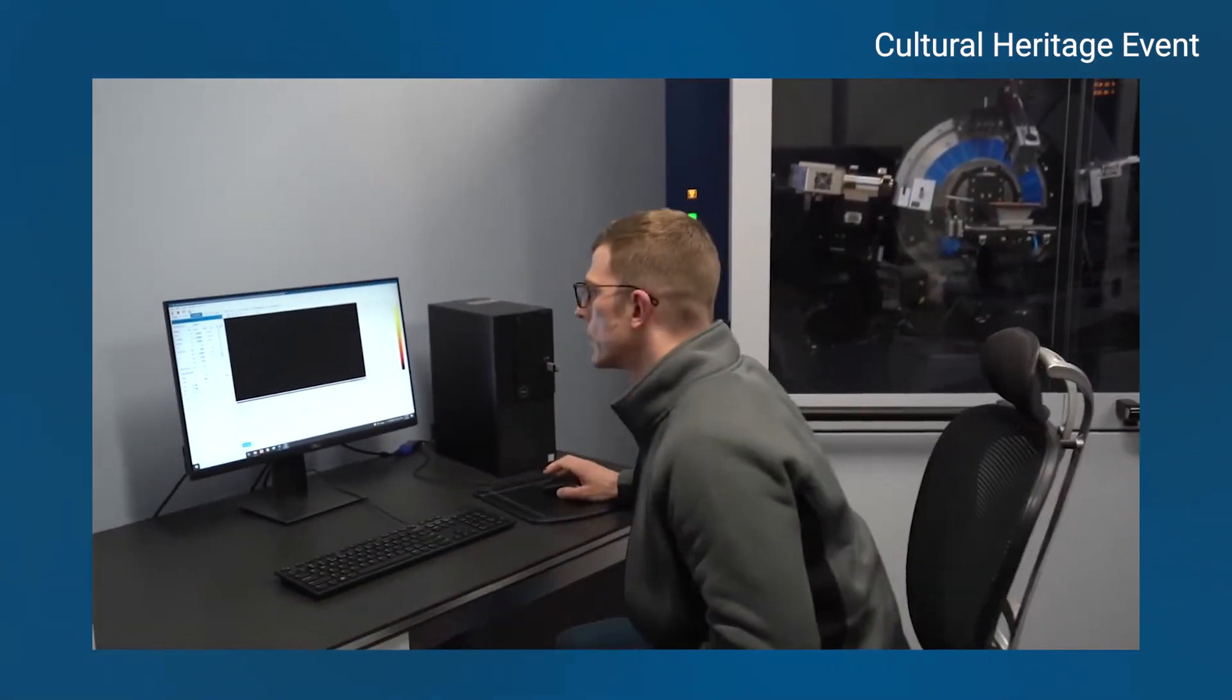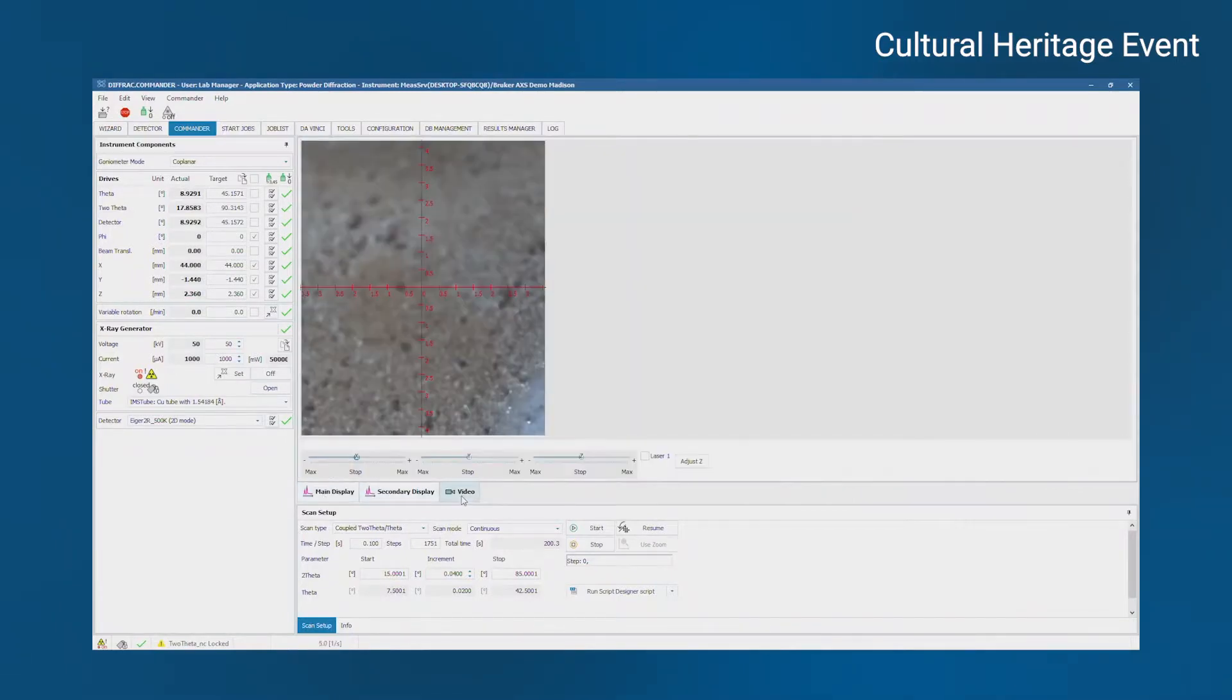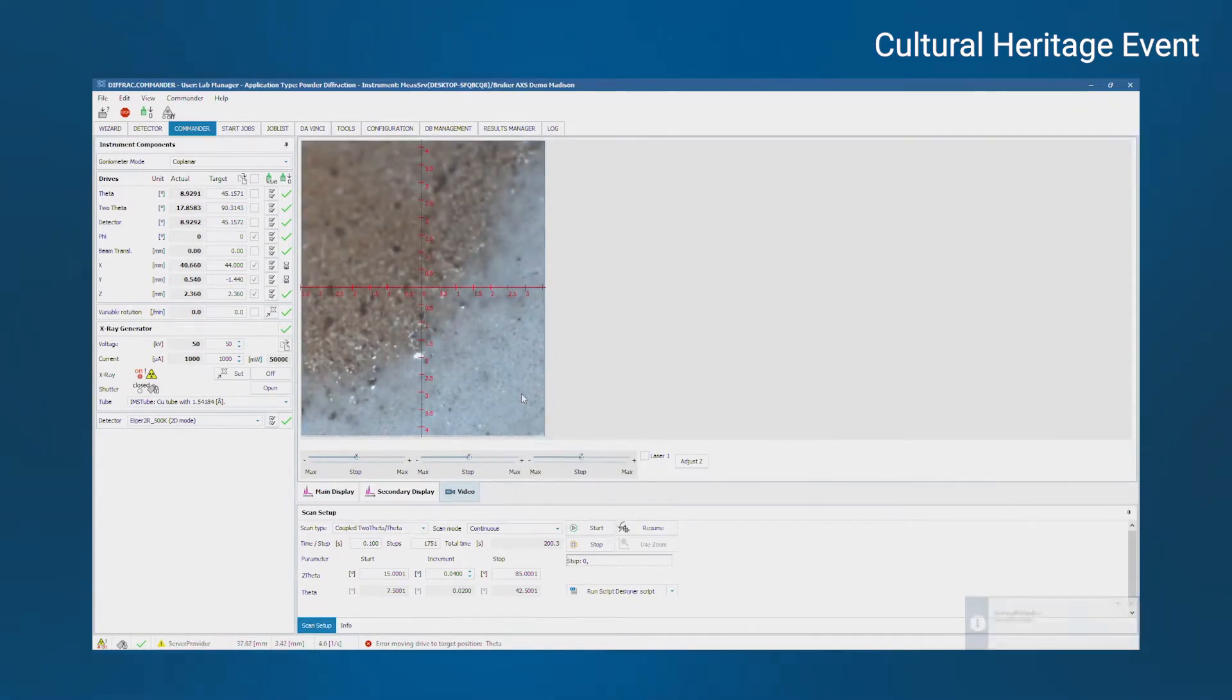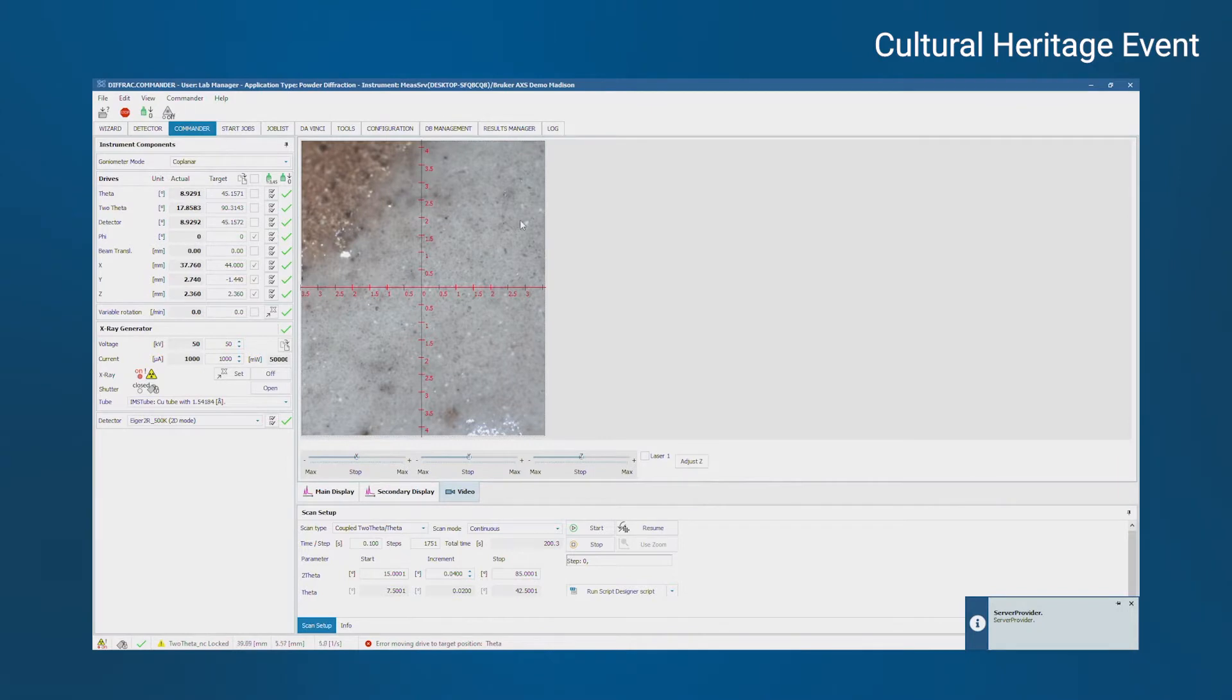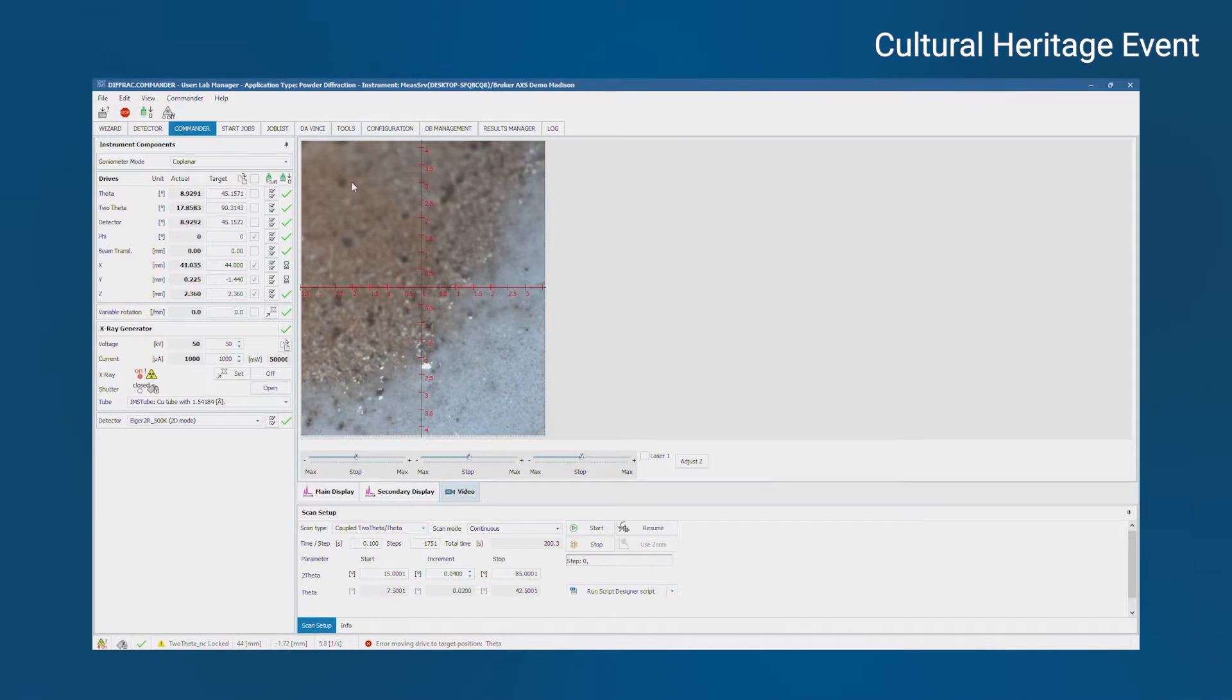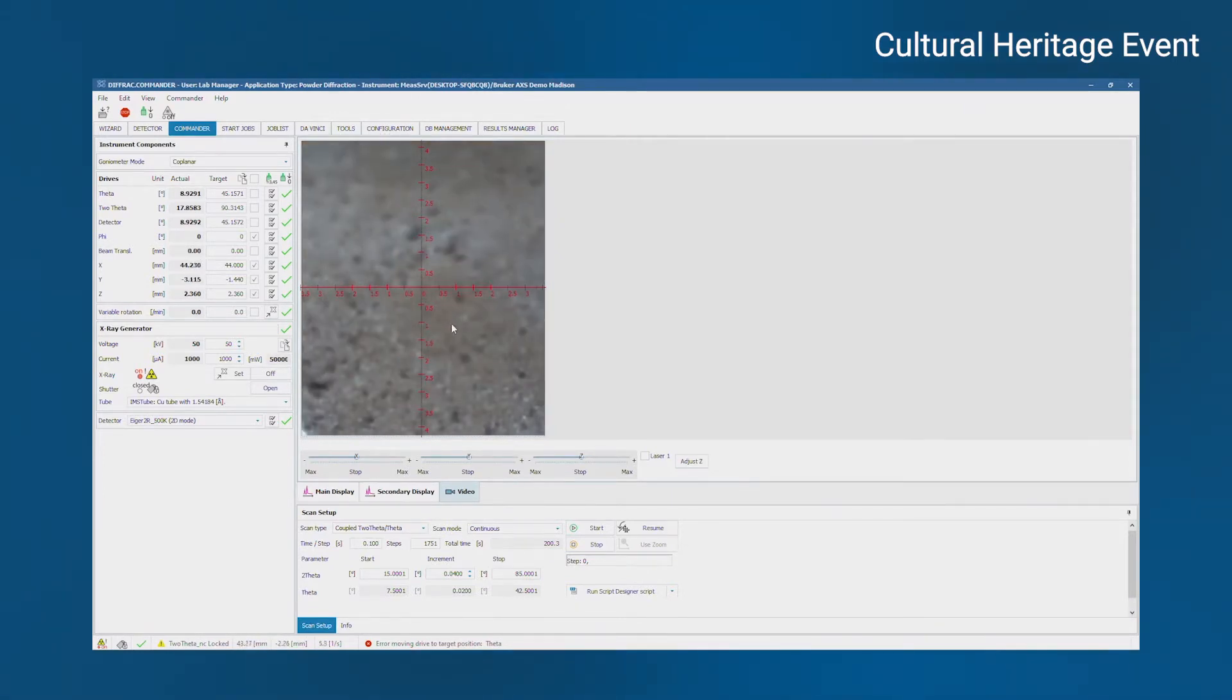Here is the measurement software. If I click to the video tab, you can see the camera image. This is showing us at the center of the crosshairs exactly where the X-ray beam is going to hit. So I can position it anywhere I like. All right, so here we are on what looks like some part of the unglazed region.